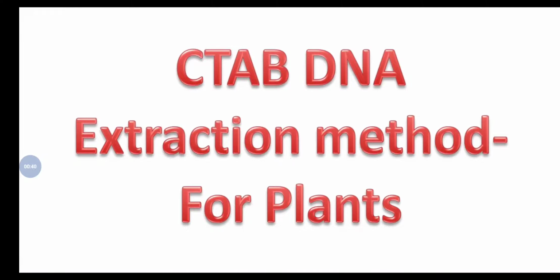All these topics we have covered in our previous videos, along with the different chemicals we utilize and the basic role of those chemicals. So for the basics of the DNA extraction method, I would suggest you go through those videos before coming to this one. Now today's topic is another DNA extraction method, the CTAB DNA extraction method, which we generally utilize for the isolation of DNA from plant cells.